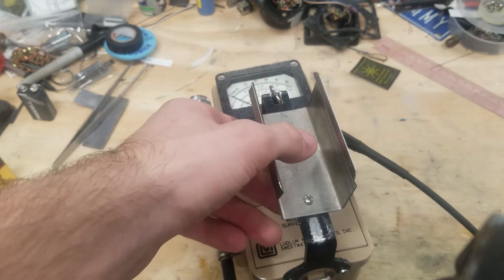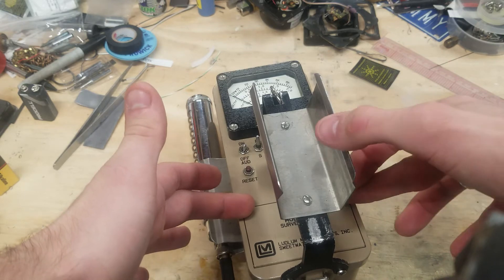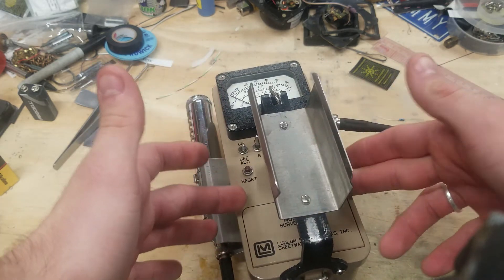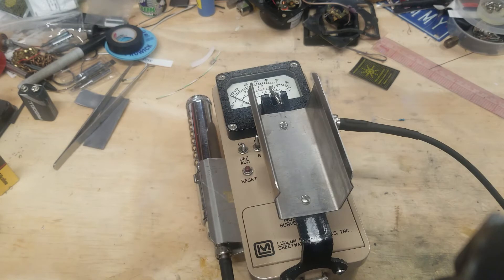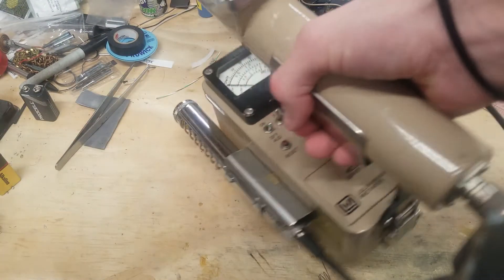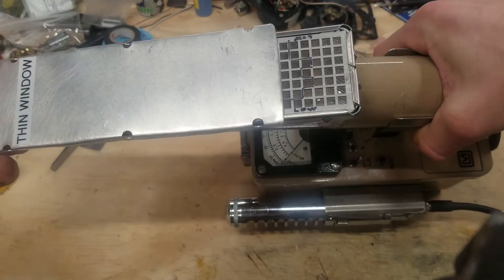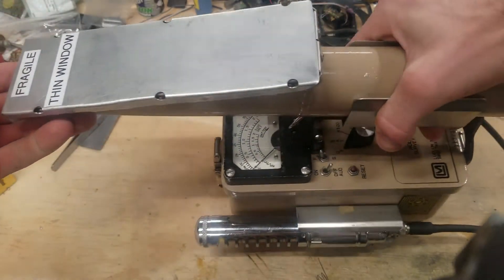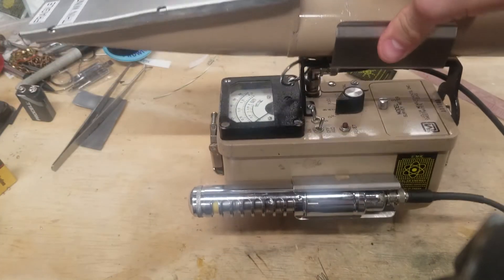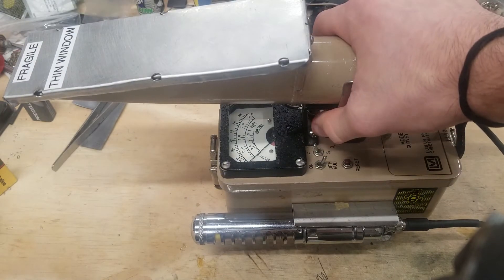They're pretty versatile meters, with a voltage supply that will go up about a thousand volts more than the Model 2 — in this case about 300 volts to 2500 volts. This facilitates the use of proportional type detectors. It also works very well with an alpha scintillator, making them very versatile meters to use and operate. Ludlum still currently manufactures them.